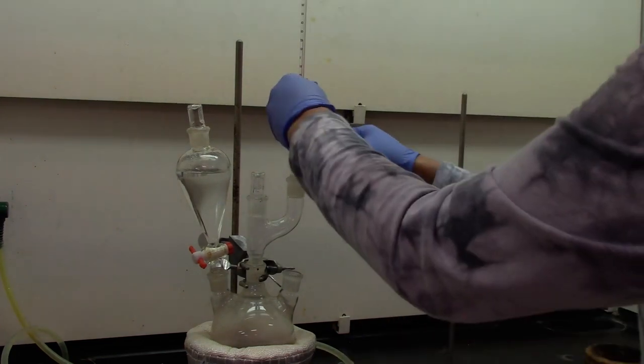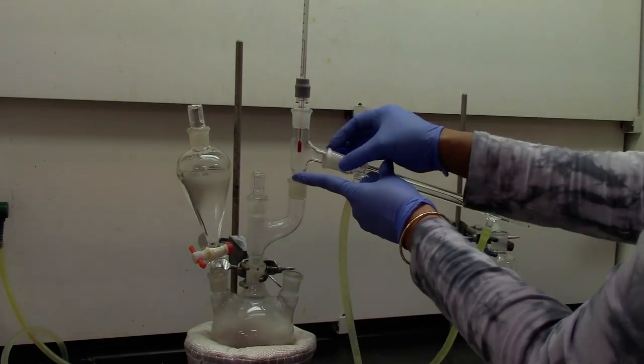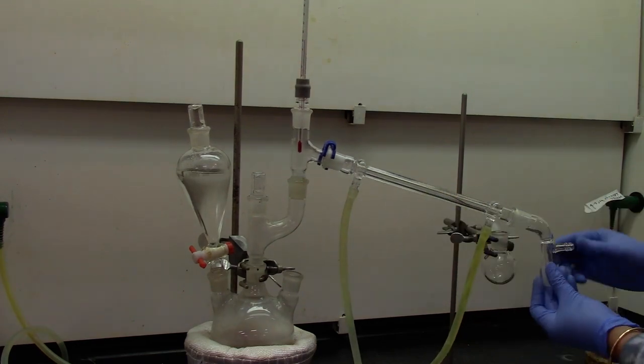Attach the 3-way connector on top of the Claisen head and the thermometer adapter goes on top of the 3-way connector.